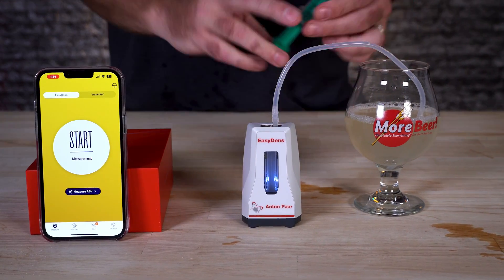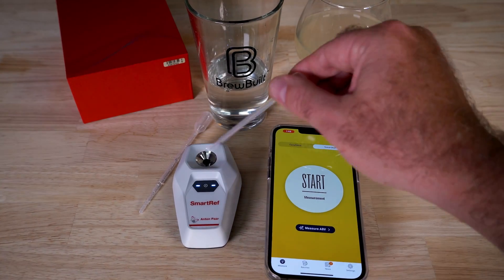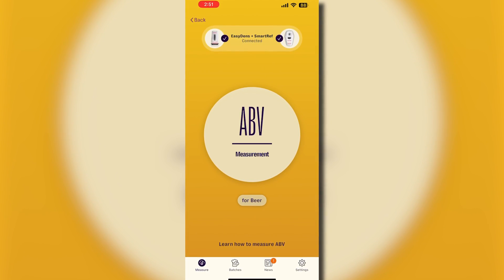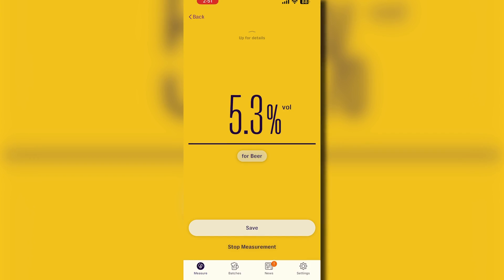You may have seen our previous videos where we go over the Anton Paar EasyDens and SmartRef. In those, we show you how to set them up, how to use them, take measurements, and all that. In this video, we're going to show you how to use these in tandem to calculate the ABV of a finished beer without having an original gravity or previous measurement.